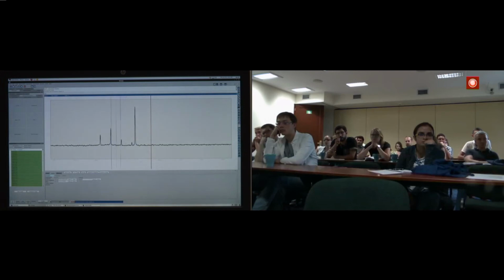But those lines would disappear then. In solid-state spectra, we have so-called rotational sidebands present on your spectrum. And they are here due to rotations, due to time-dependent interactions, due to rotations simply introduced by our MAS technique.